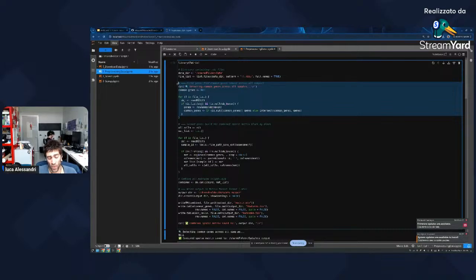But if you have more datasets and you have to integrate all of them, you need to choose either the common genes, this is what I did right now, or you have to make another script in order to put a 0 for all the genes that are not shared across all the samples. So this is pretty important to do.